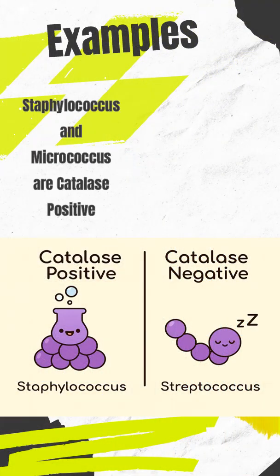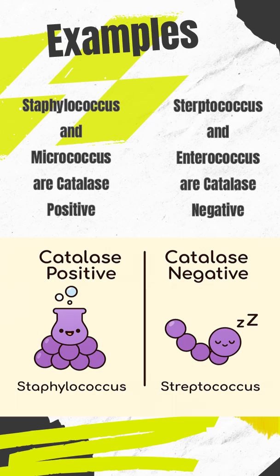Staphylococcus show bubbling, making them catalase positive. In contrast, Streptococcus show no bubbles, meaning they're catalase negative. This simple test helps quickly distinguish between these two important gram-positive cocci.